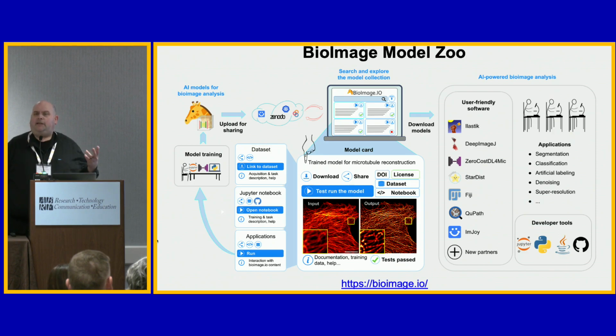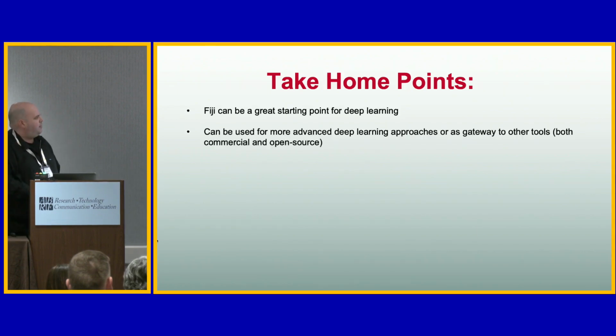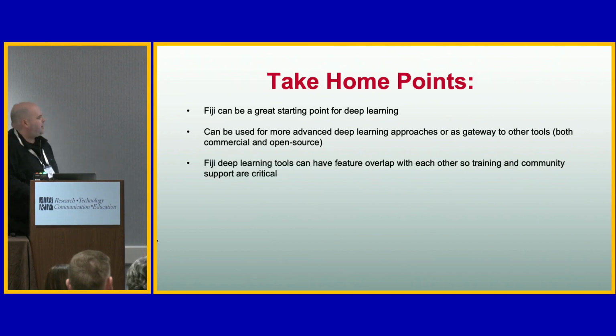That could be just looking to see what others do, being on the forum, looking at videos, there's a ton of tutorials, or going to in-person training or online training. And so I'll talk a bit about that, but there's a couple of take-home points. Fiji can be a great learning tool for deep learning, a great starting point. You can use it for more advanced deep learning approaches, such as Model Zoo, or it can be a gateway to other tools, both commercial and open source.